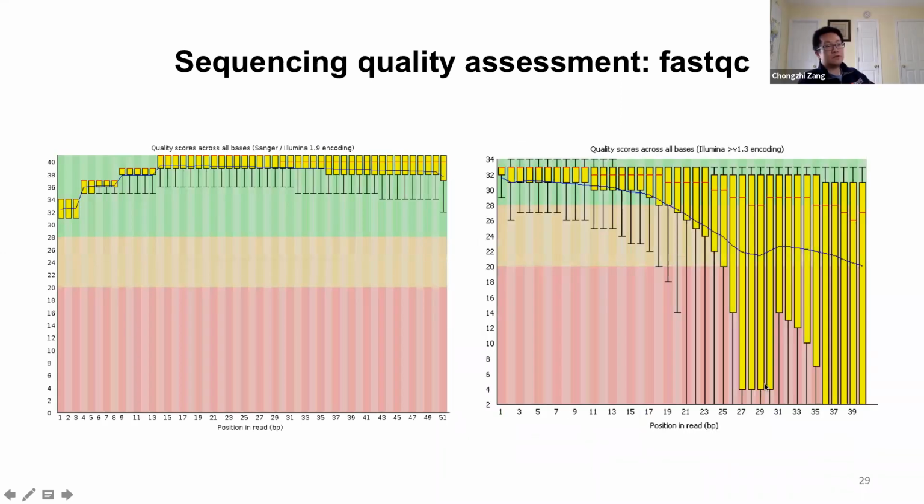First we simply ignore this QC measurement, and just do the sequencing alignment and look at the quality assessment of the sequencing alignment. Even if the quality of some of the bases is bad, as long as most of your sequence reads can still be mapped to the reference genome, that means the data set is still usable.